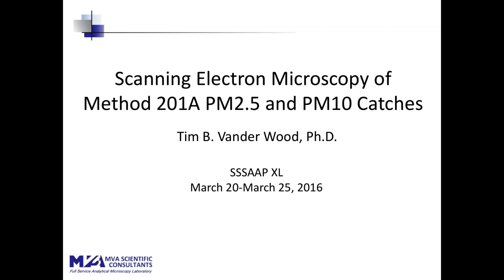Beginning today, we will be offering a series of webinars that focuses on microscopy particle sizing and particle identification to illustrate how these applications benefit the stack testing industry. For this webinar, we will focus on SEM analysis of method 201A filters.